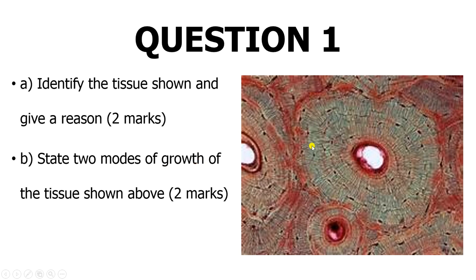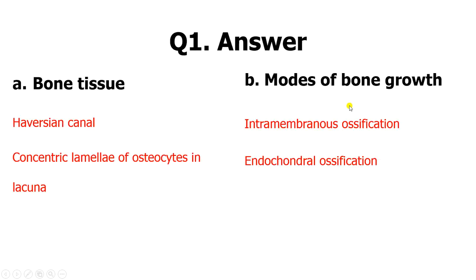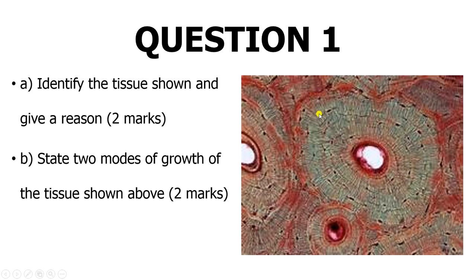This tissue is bone tissue. How you identify it is by the presence of the Haversian canal and the presence of the concentric lamellae of osteocytes in lacunae. This is actually the Haversian canal — you can see it here — and these are your lacunae.